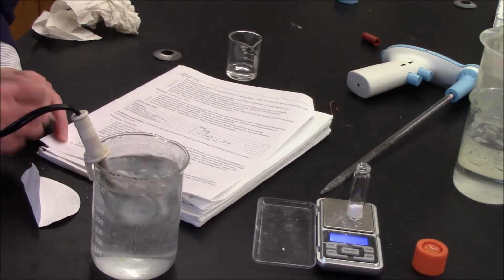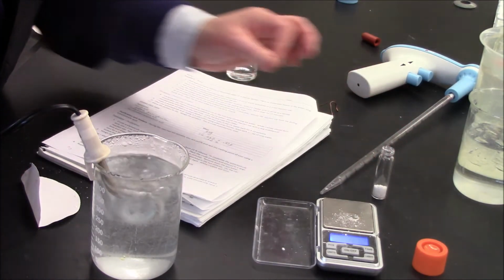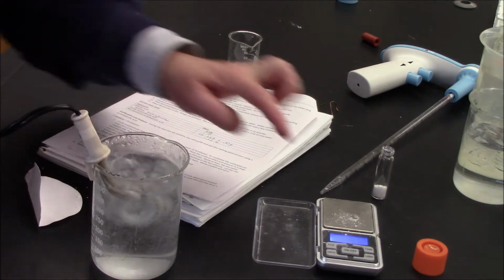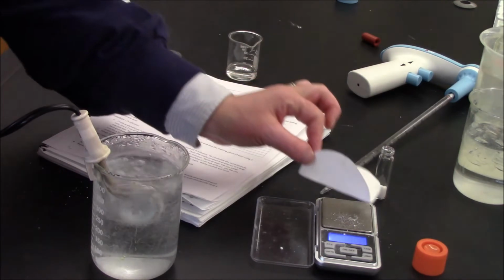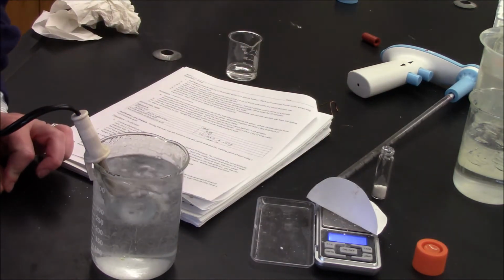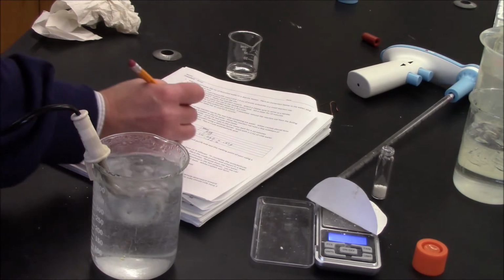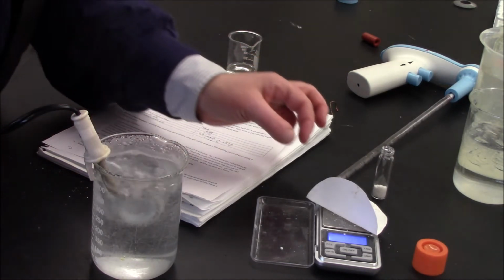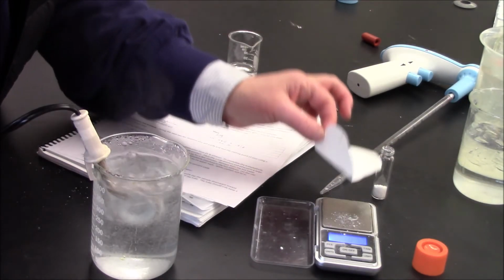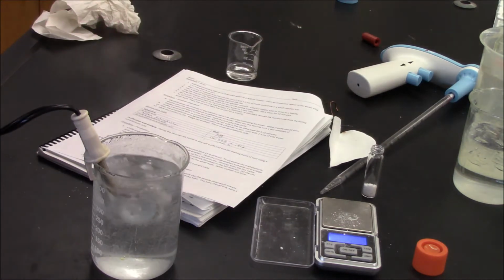So in order to check my numbers, I wrote down what I had off my balance, but I reweigh my filter paper now. And when I reweigh my filter paper, I see that the mass is now 0.7 grams. So remember, originally its mass was 1.1 grams. I write that down, and I assume that I've added about 0.4 grams of my crude product to my reaction vial.